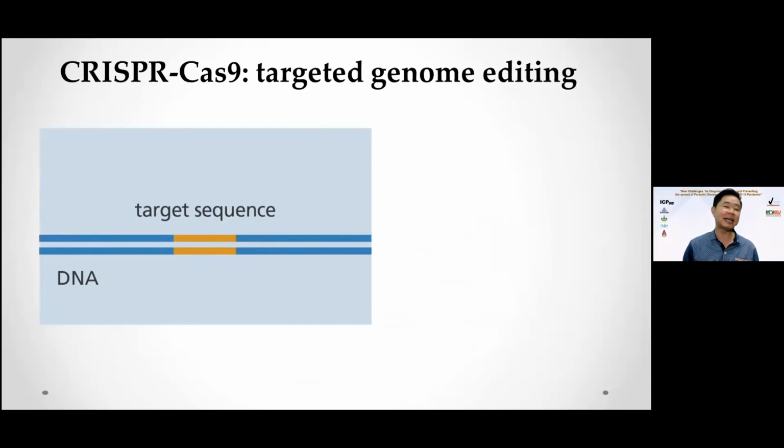In this case, the genome of Opisthorchis viverrini is already sequenced. So we contacted the person who sequenced it, who is working at Melbourne University, and asked them, can you provide me the sequence of OV granulin 1? And then we decide the target gene.